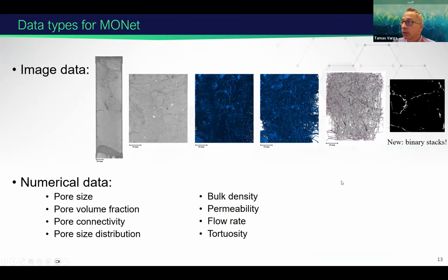And now this year we started saving off from the Aviso segmentation the segmented porosity data, which is basically binary data, pores and everything else, and we create binary image stacks for each of the connected, unconnected, and all the pores, because we figured that would be a useful thing to also visualize for the users.